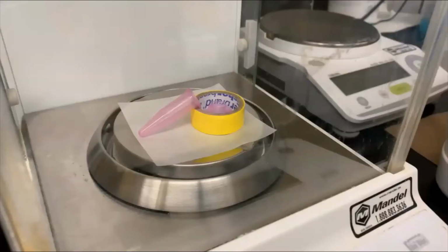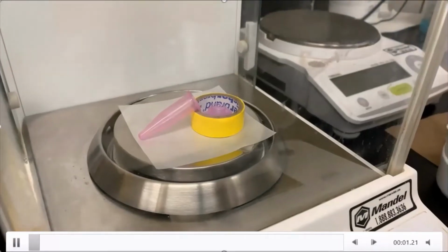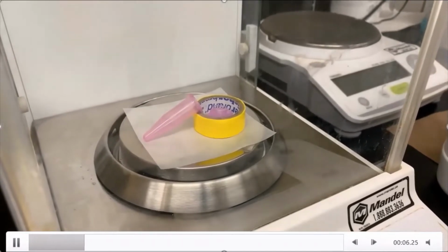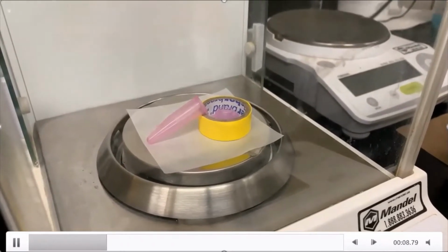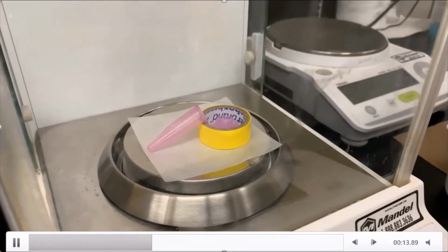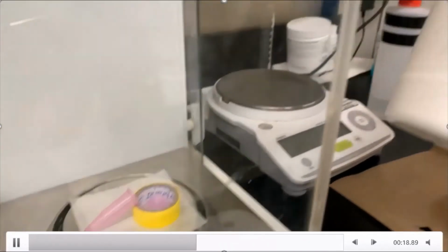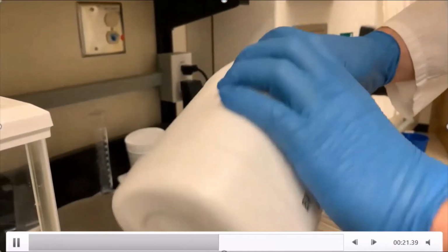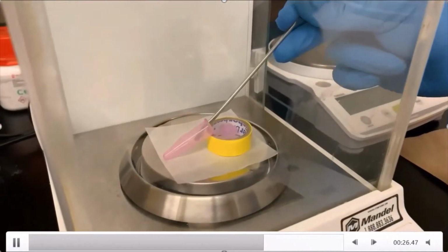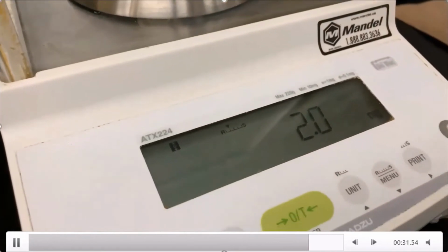So here we are weighing out the glucose standard for our calibration curve. We have a microcentrifuge tube resting on some tape within the scale. That way the glucose is measured directly into the tube. We never take any powder back out of the tube, and we try to get as close to the mass that we've calculated, and instead of adding more or taking out more, we adjust our dilution volume to get the proper concentration for our standards. So you want to read your mass and then change your dilution after to get the proper concentration.